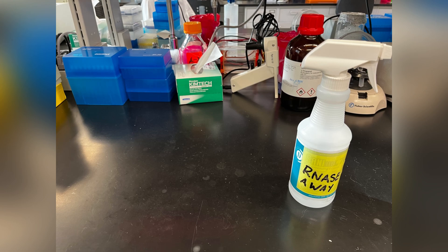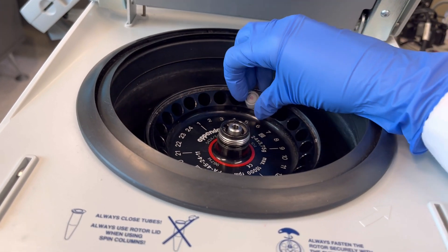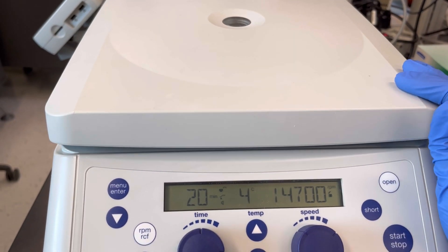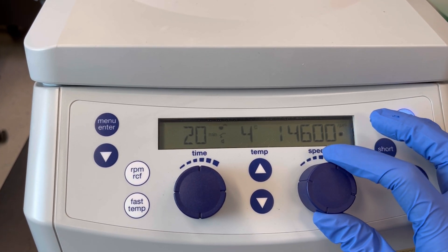Wipe down your bench before putting your tubes on it with RNase Away. Spin it down for 15 minutes at 14,000 rpm.